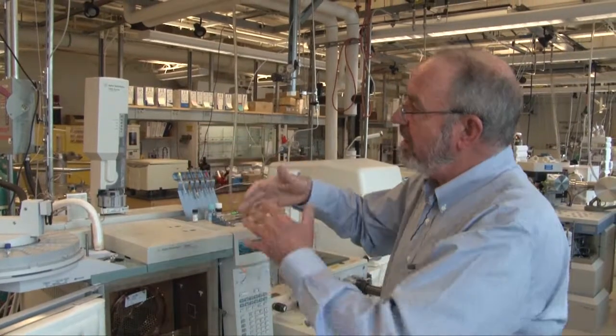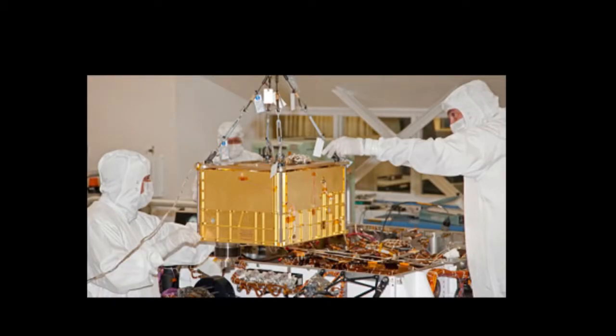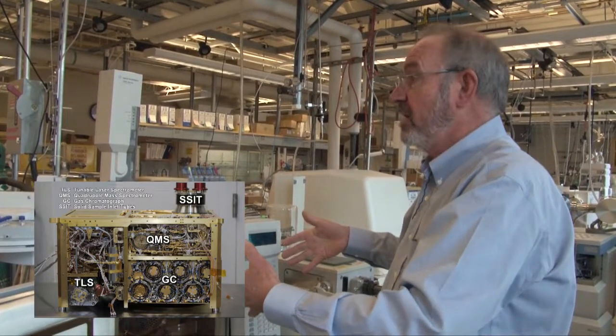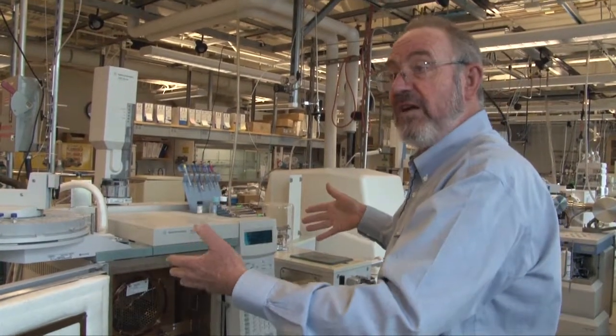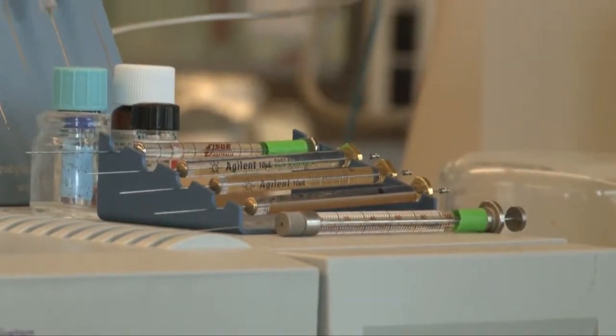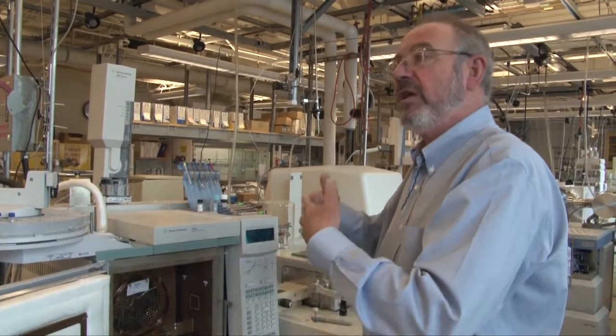So this is a very large instrument. SAM is itself a bit bigger than a suitcase. So the instrument on Mars is a miniaturized version of this. But the advantage of having a machine as complicated as this, we can vary the conditions of the experiment according to what we find on Mars, improve the quality of the experiment, improve the fidelity of the experiment, provide information for the next sort of planning stage, how the next experiment is going to be done on Mars.